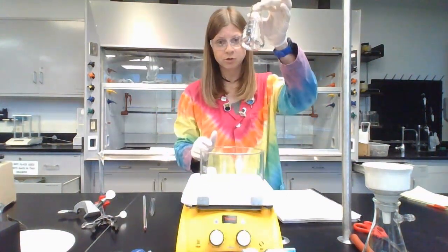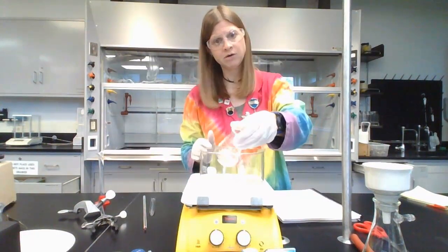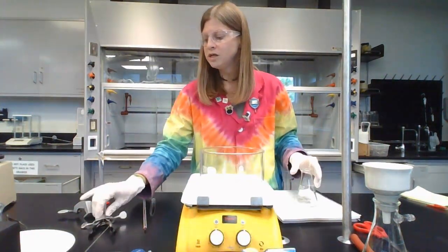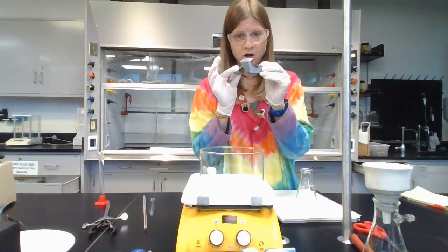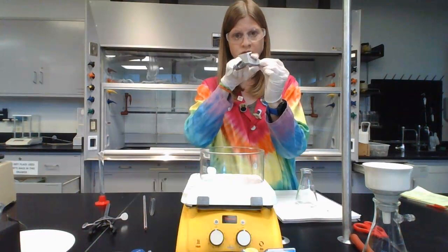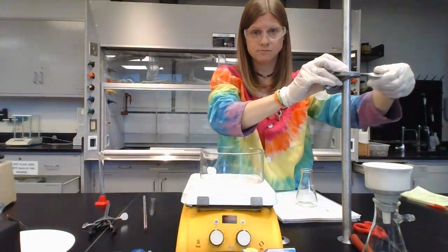So we want to submerge our Erlenmeyer flask in the water bath, but if we just try to put it in now, it would float around and bob around and knock over. So we need to use a clamp to hold it in place. So you're going to start with a knuckle, which just has 2 things that connect here, and I'm going to attach it to my post.